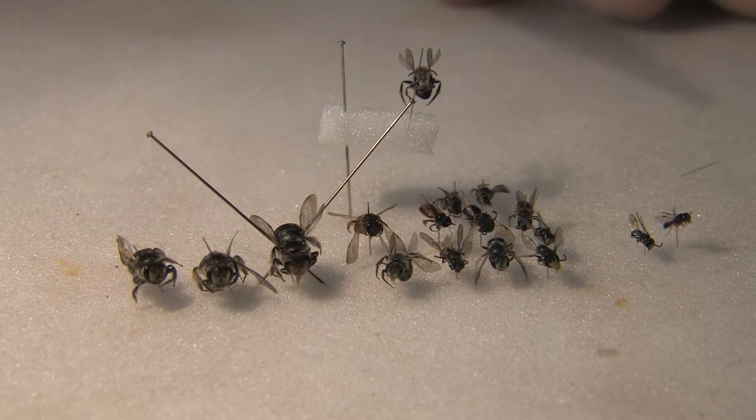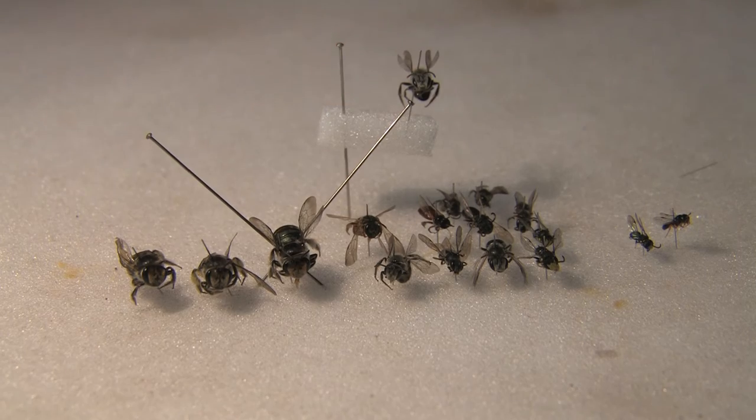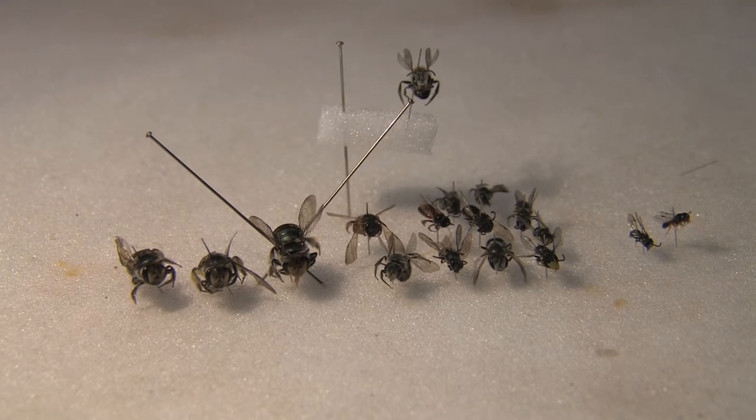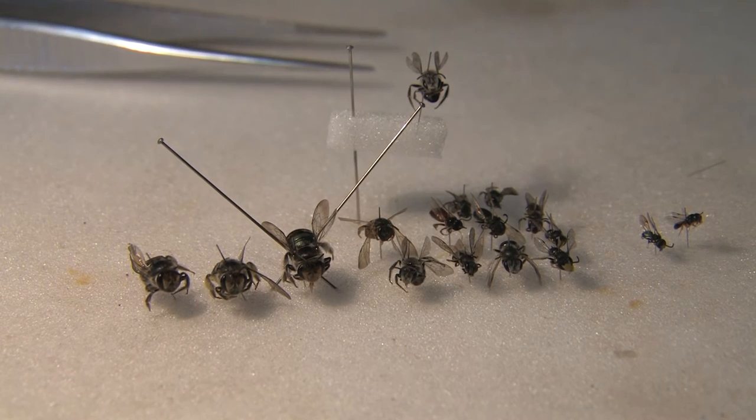So there we are — very simple, not too hard to do. The pinning uses the A1s for the smallest, the B2s for medium, and the B3s for the largest, and we simply use a pin and a straight pair of forceps.